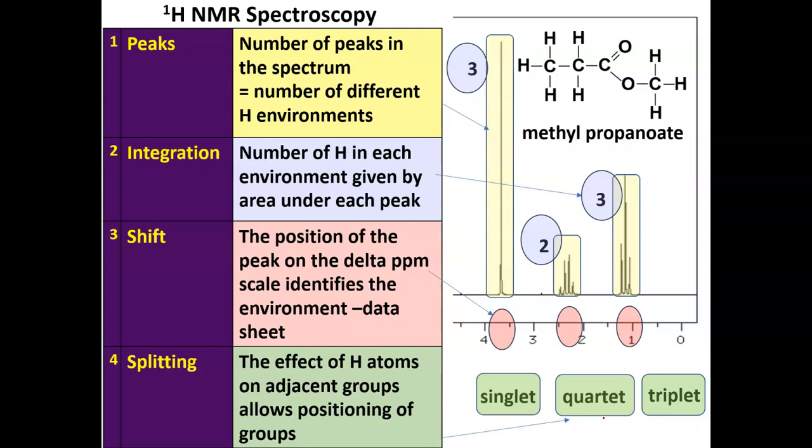More about that soon. The third level of analysis is, of course, the chemical shift scale. And the chemical shift scale for Proton NMR, we more or less center the peak. If it consists of several peaks or components, then try and get the center of that grouping.